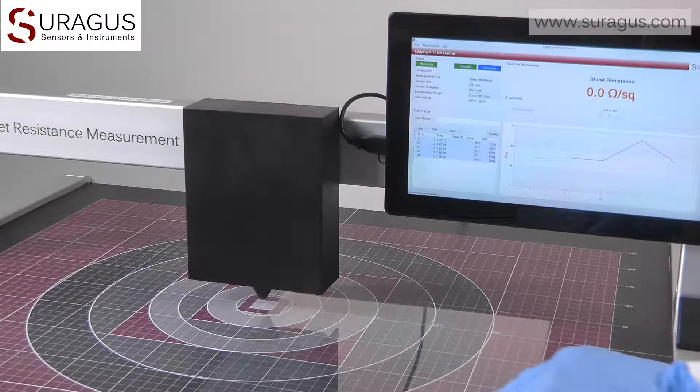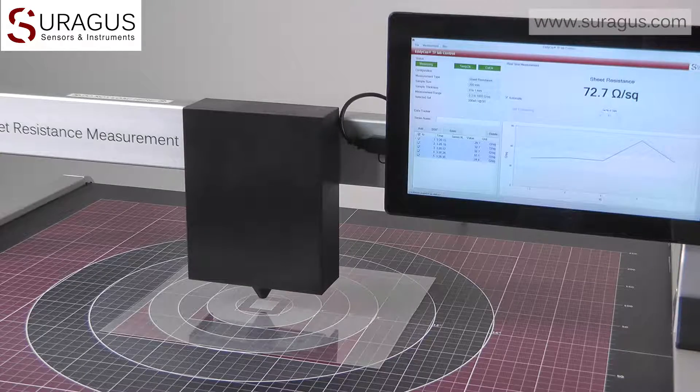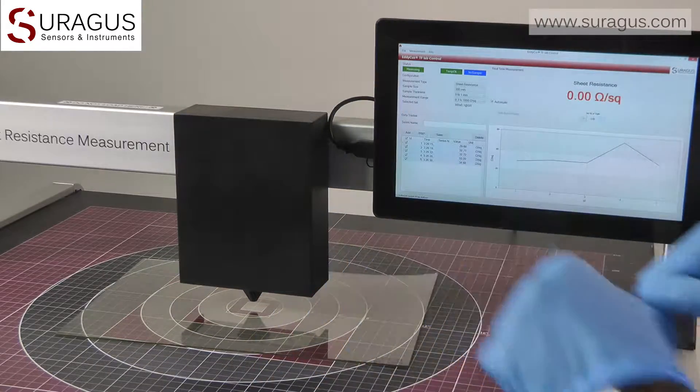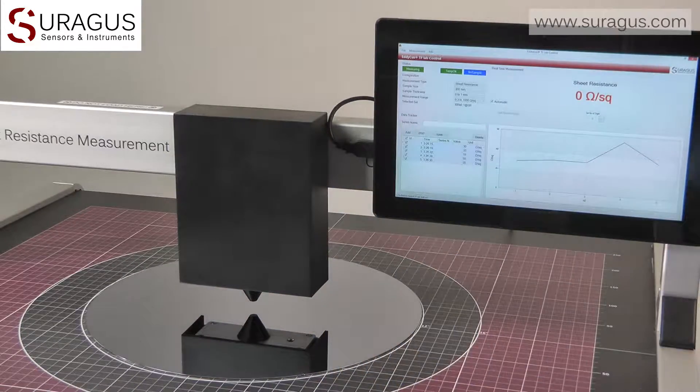Among the huge set of applications, it is easy to measure transparent conductive electrode materials on glass or foil. We can for example measure sensitive or inaccessible transparent conductive materials, low E-layers on glass, or semi-conducting wafers.